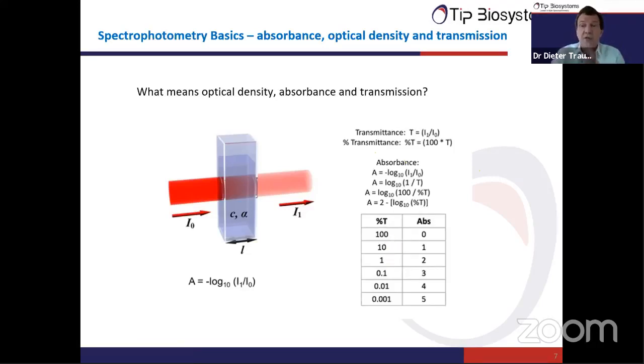If 1% of the light goes through, then our absorbance is actually 2. Now you can also understand why most instruments can only measure absorbance up to 2 point something or so, because an absorbance of 3 means there's only 0.1% of the light that goes through. So your light detector must be very good and very sensitive. Okay, so absorbance is a logarithmic scale, and transmission is just the percentage of light that can pass through your sample.